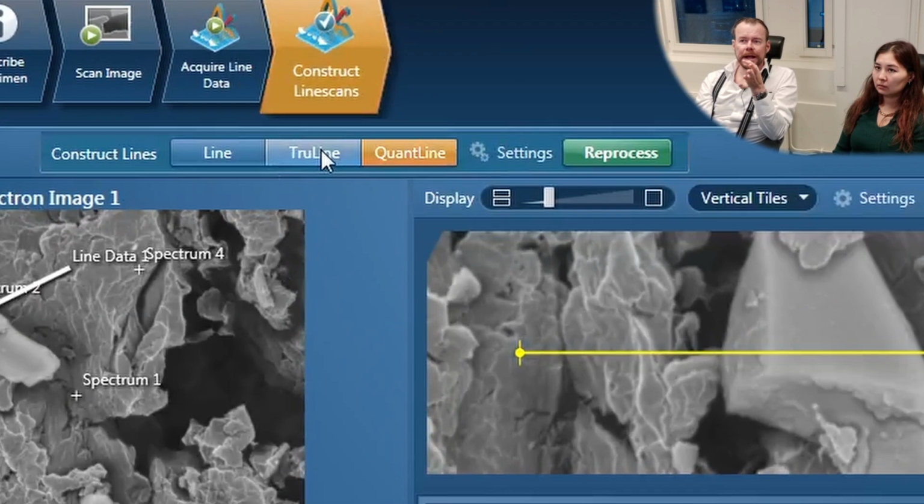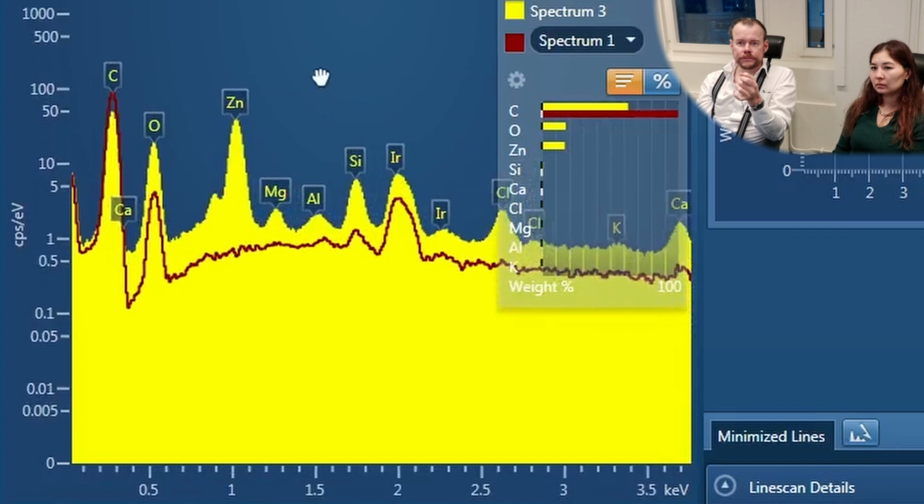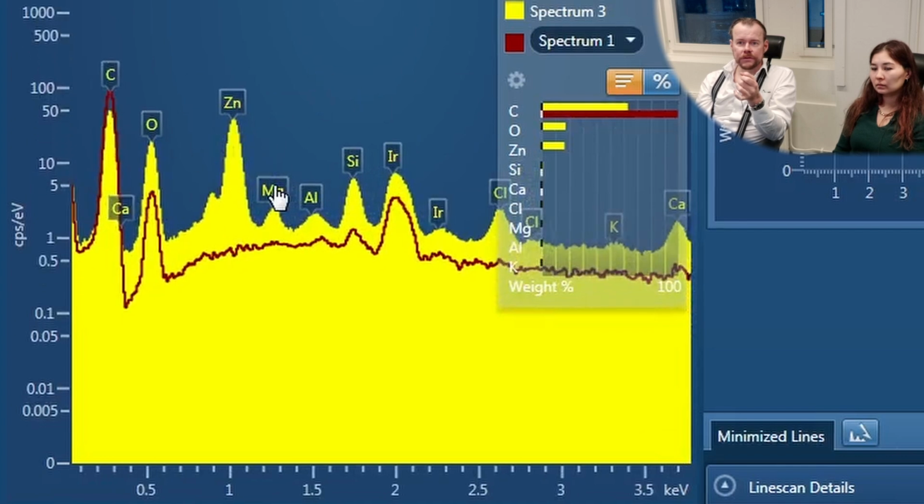The true line here is like, that can be a little bit, when we talked about this sodium case here, the sodium was overlapping a little bit. We decided that we don't believe that material contains sodium. Here was the spectra, right? We talked there was sodium here.